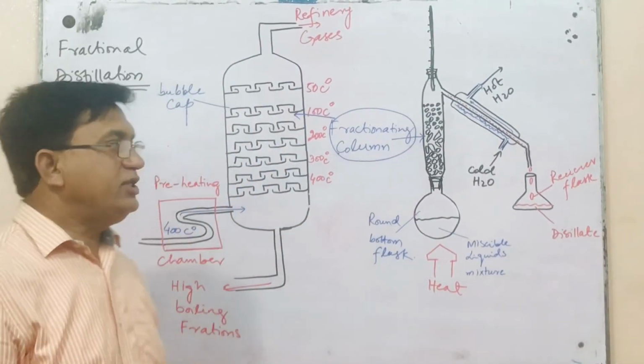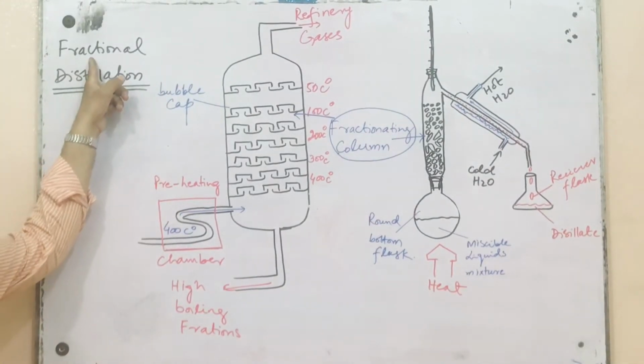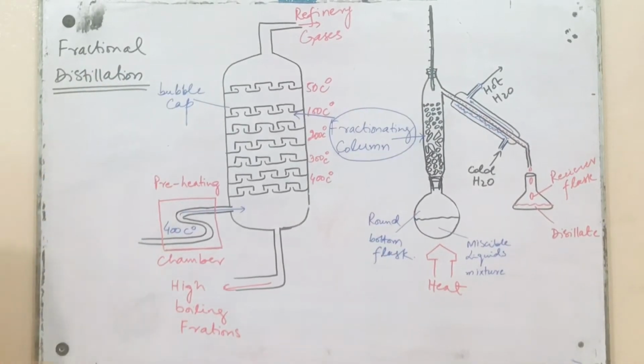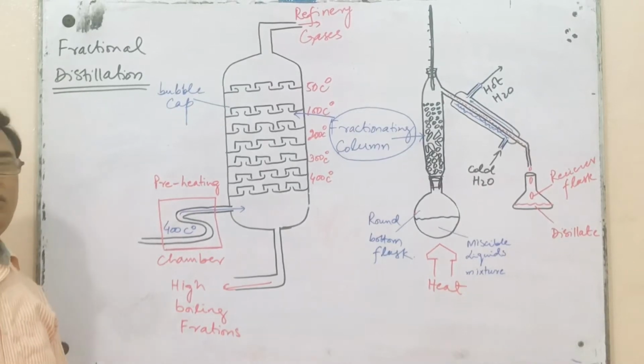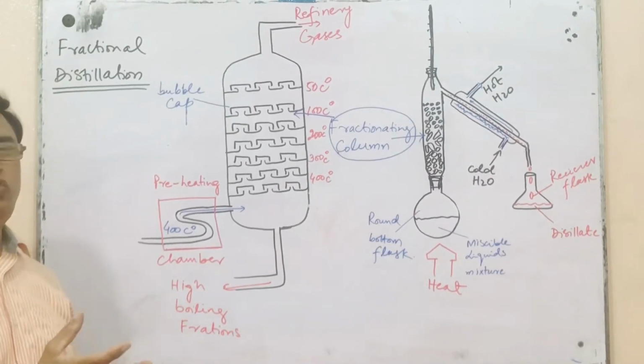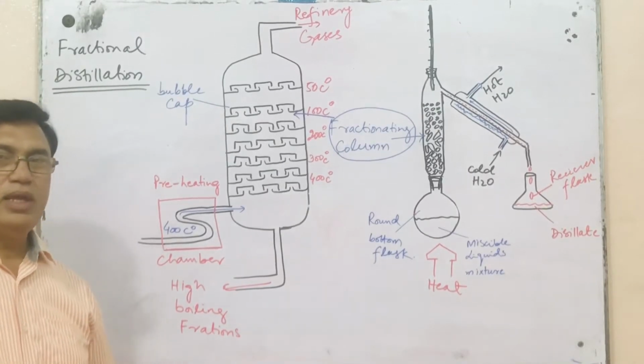Our today's topic is fractional distillation. Now, in the previous video, we have discussed simple distillation. And I have explained that simple distillation is the separation or collection of liquid from a solution of liquid and solid or salts.